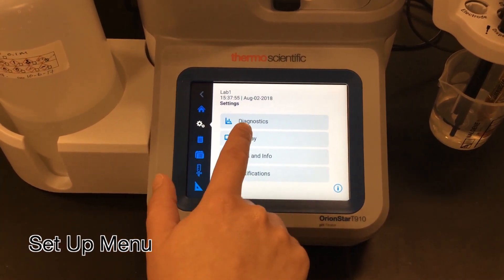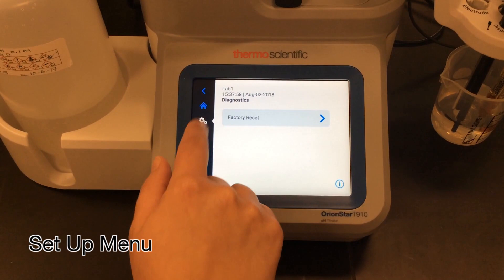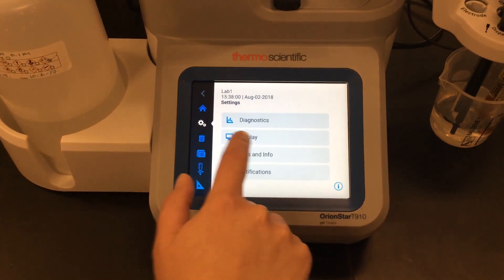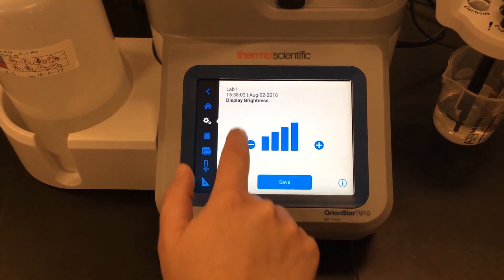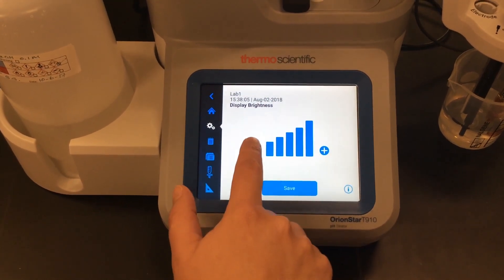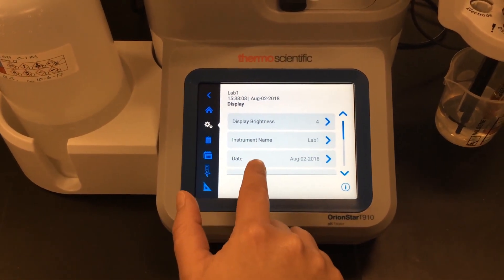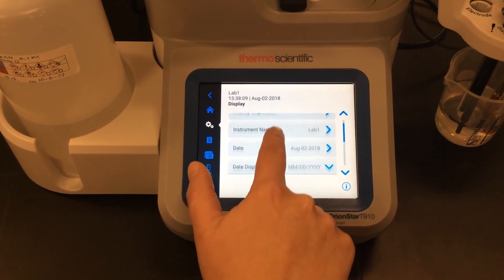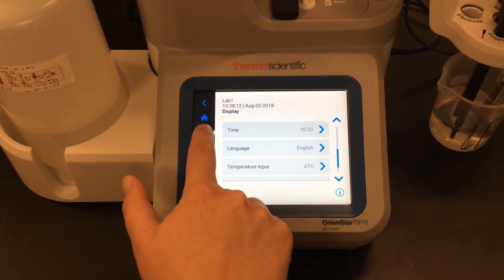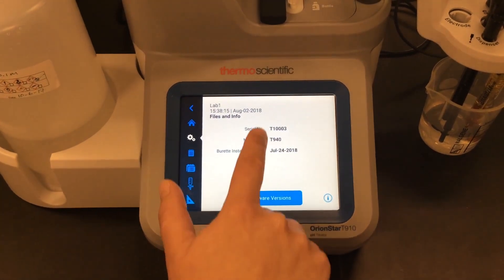From the setup menu I can change all of my instrument settings, go into the diagnostics, and do a factory reset. I can also go into the display and adjust the brightness. I can change my instrument name, set the date and time, and also change the language.